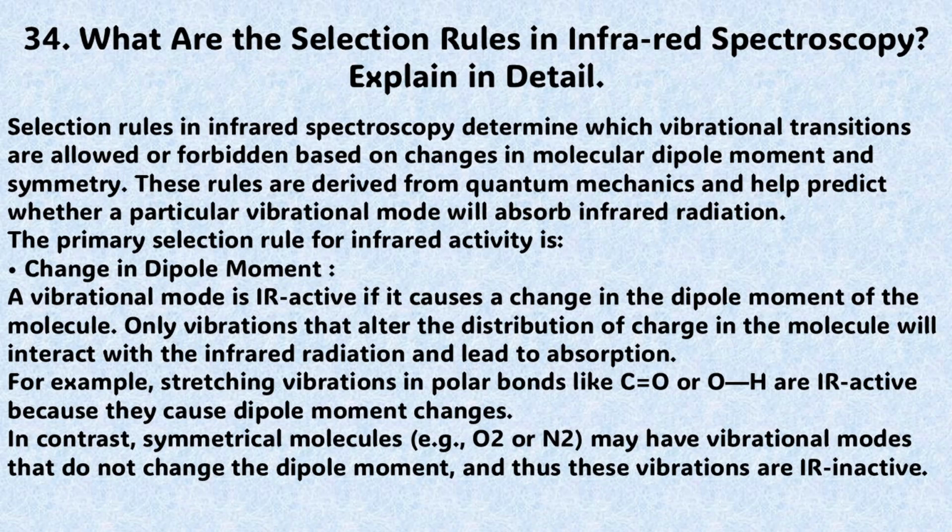radiation. The primary selection rule for infrared activity is change in dipole moment. A vibrational mode is infrared active if it causes a change in the dipole moment of the molecule.